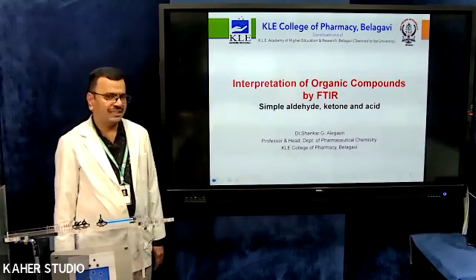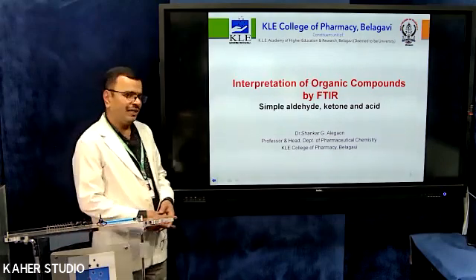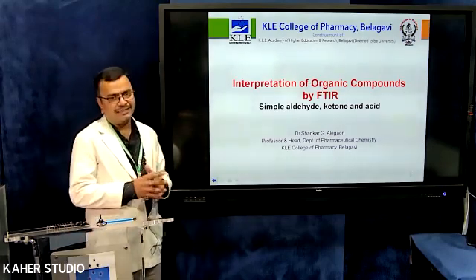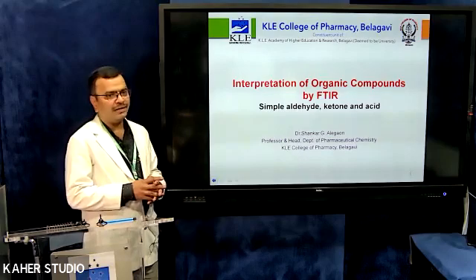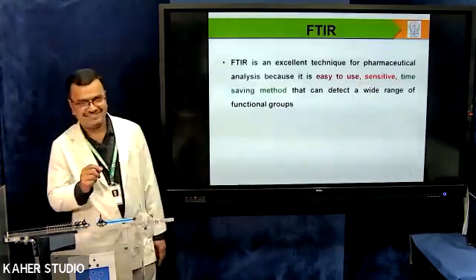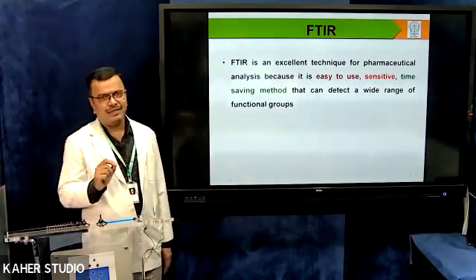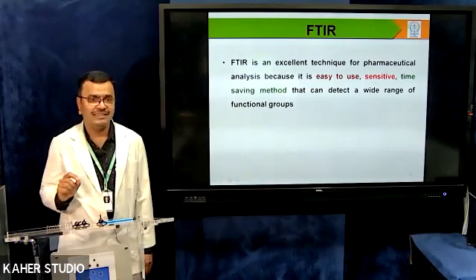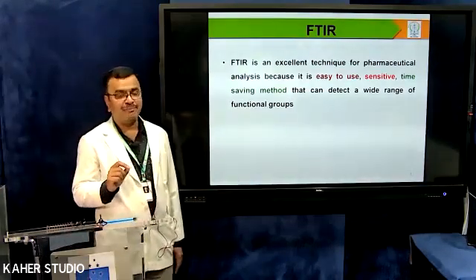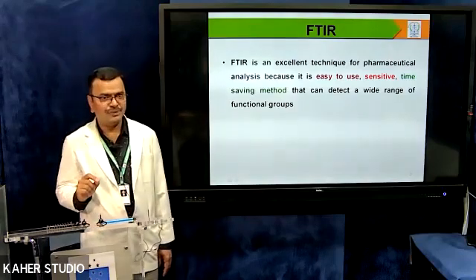Today, I am discussing the interpretation of organic compounds by FTIR spectroscopy, and I have taken simple aldehyde and carboxylic acid today. Why FTIR? FTIR is one of the best and most excellent techniques in pharmaceutical analysis and analytical chemistry because it is very easy to use, sensitive and time saving.